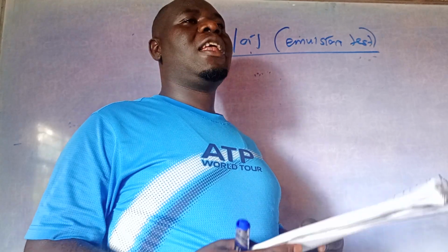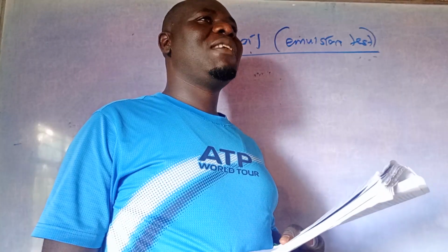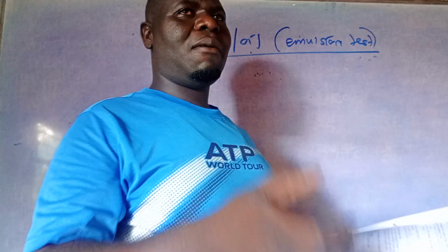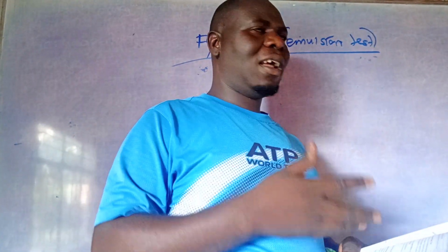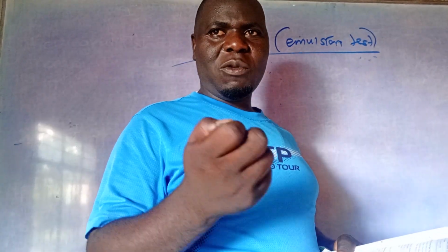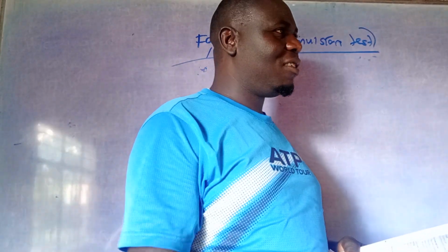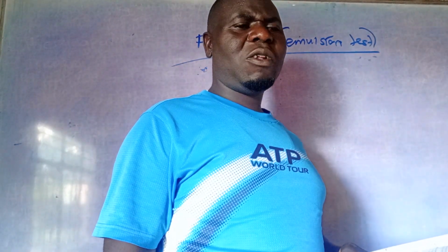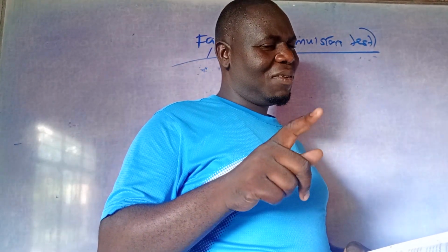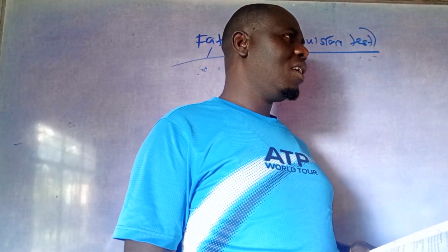Sometimes they can give you groundnuts, since groundnuts contain oil. Sometimes even cassava flour. For the testing, you take a sample, then you have the lipid test. I'm testing for lipids, right? So think about the method. You know the method. It's simple.